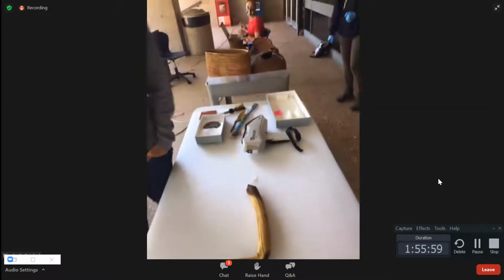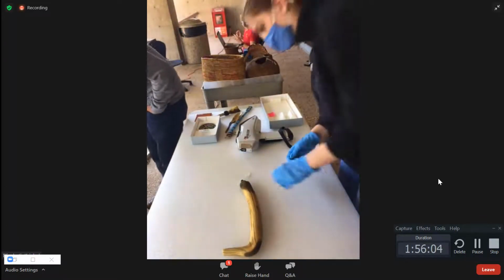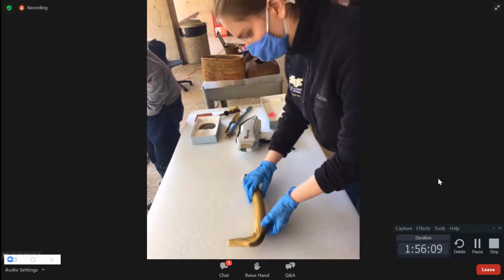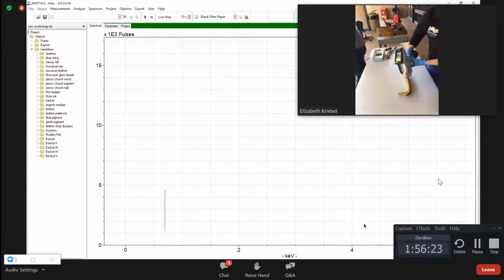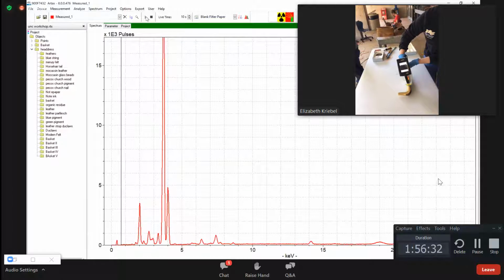So that's wild, but this must be bone. So we should use calcium and phosphate. And there's some nails in the bottom as well. Oh yeah? We can take a quick look at those too, make sure. But I think just measure this area right here. Okay. We'll be good. And object number is, I got it. Ready? Yes. Yep. Calcium phosphate.